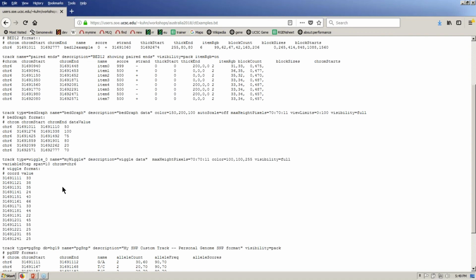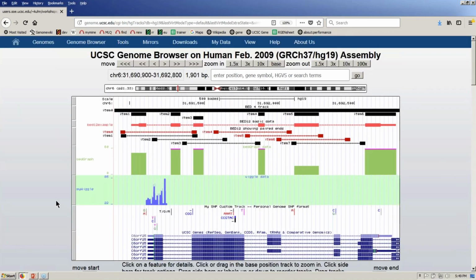characters of data plus the space by simply throwing away the chromEnd, and your data set is condensed down now into a chromStart coordinate and a value, that's the height, and the chromEnd coordinate is simply computed by adding the span. So if I go back here, you can see here's a track, a Wiggle track. So that's the preferred method of displaying data that's continuously variable across the genome.